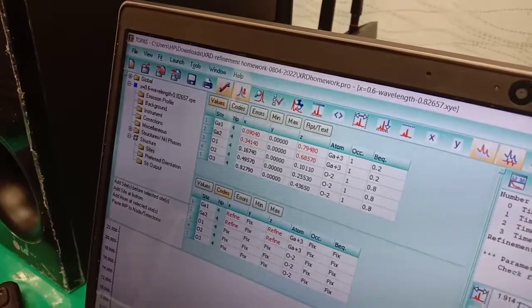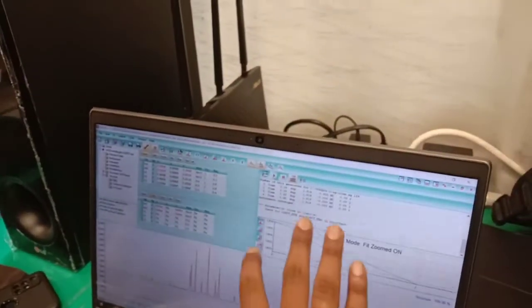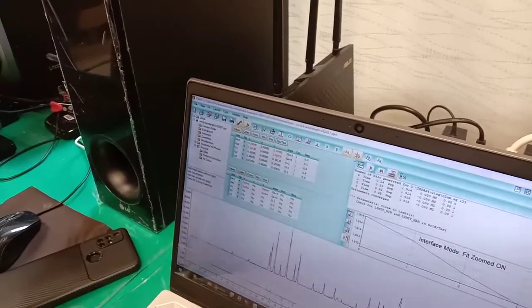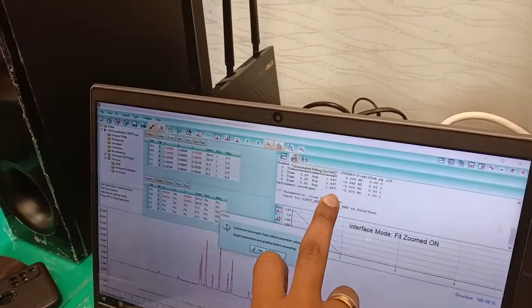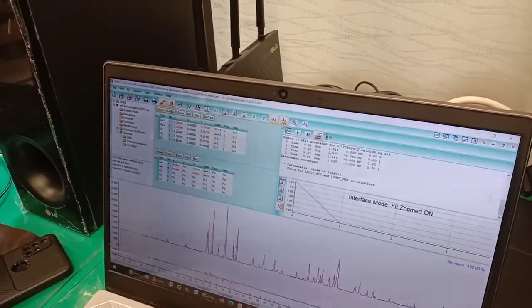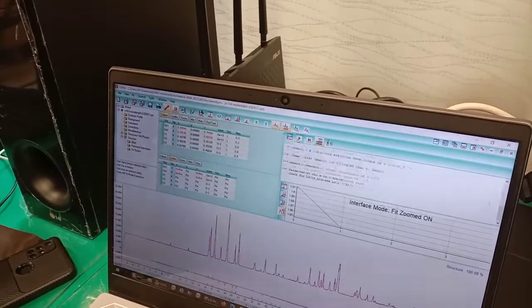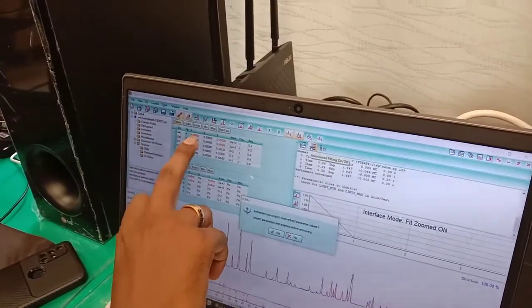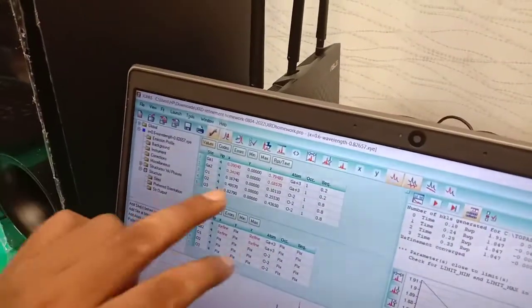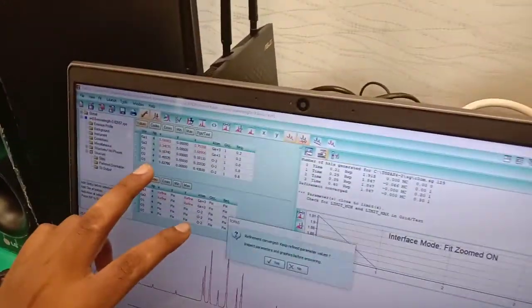Okay, so just run it, and you have to see whether this one is decreasing or not. If it is decreased, it is much better. If it's increased, you should not refine it. Similarly, you also have to check this position, whether it is moving a large amount or not. You can see it's decreasing and it also moves a little bit. Maybe before it was 1.9, now it is 1.847, and it turned into some very little change. Maybe you can say it's 0.08, right? Yeah. Now you can see it's 0.8.